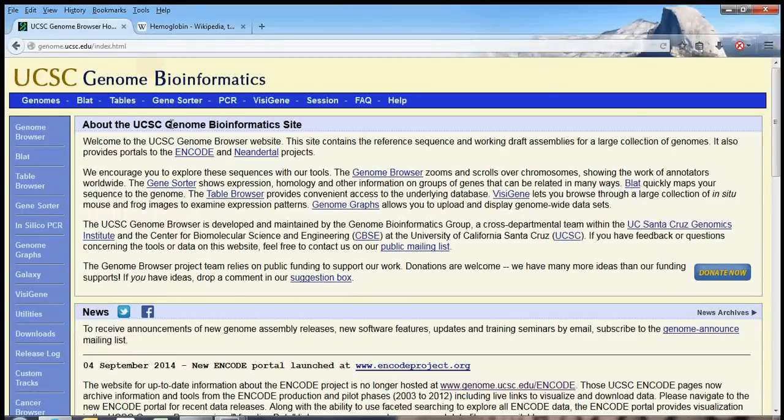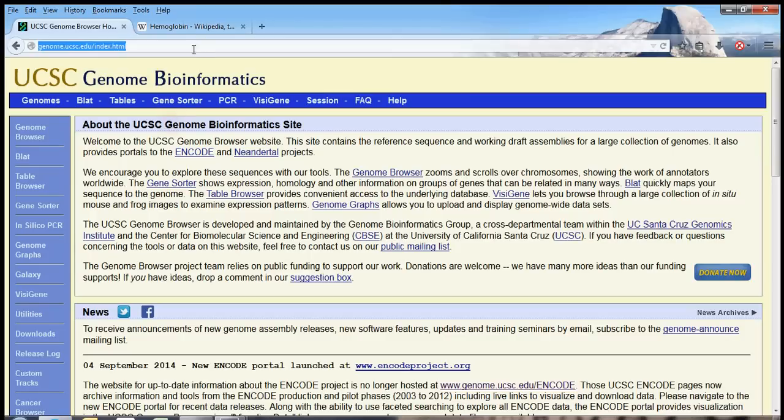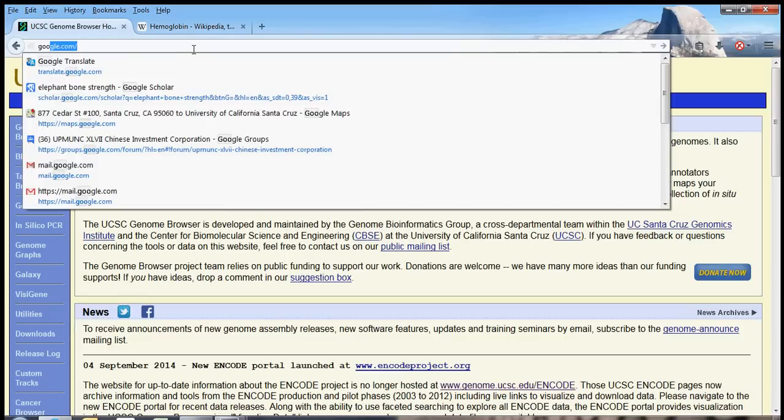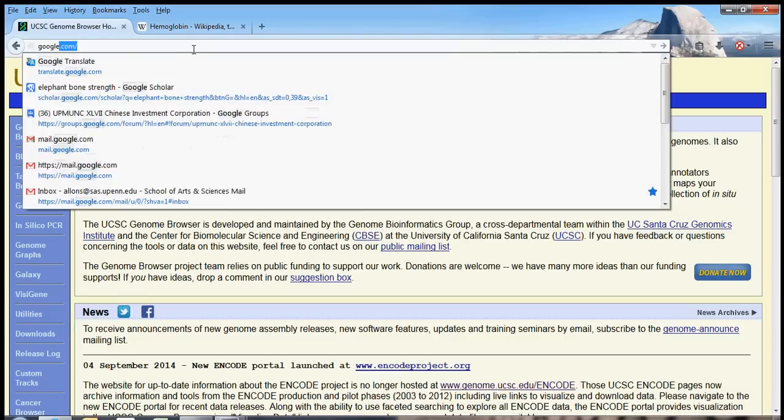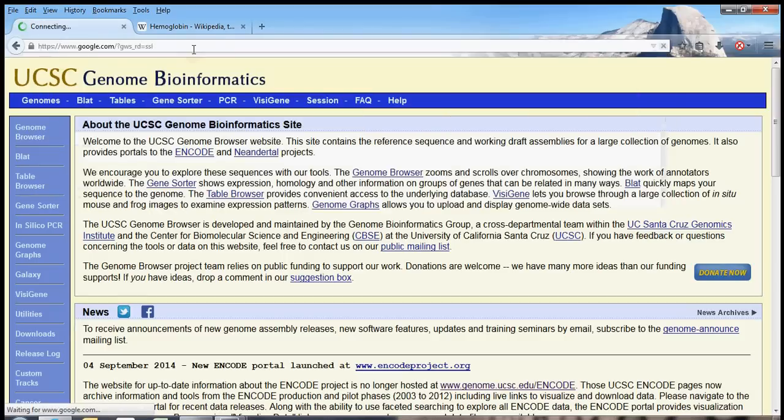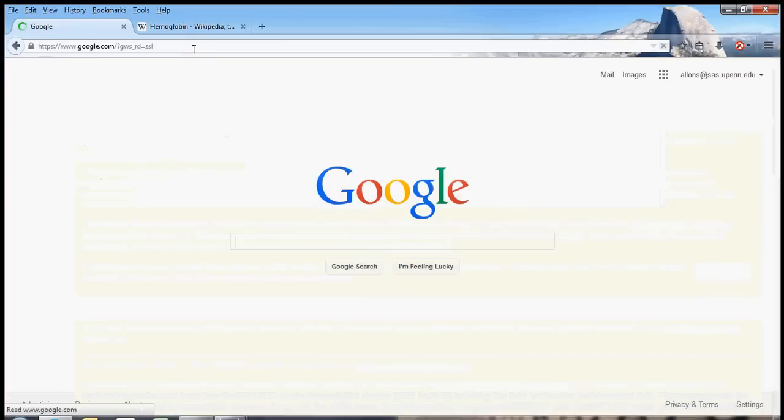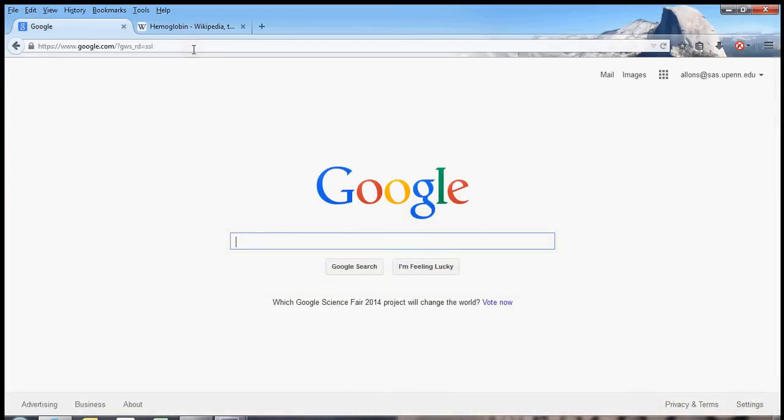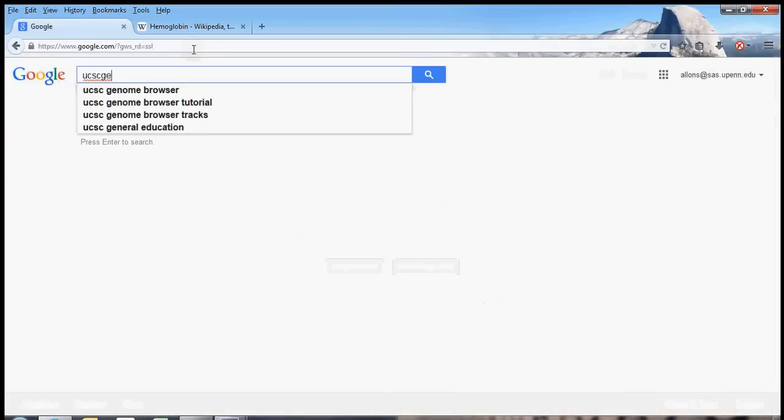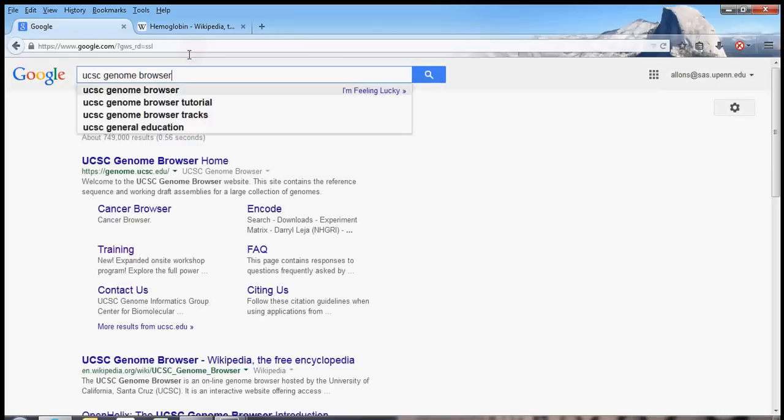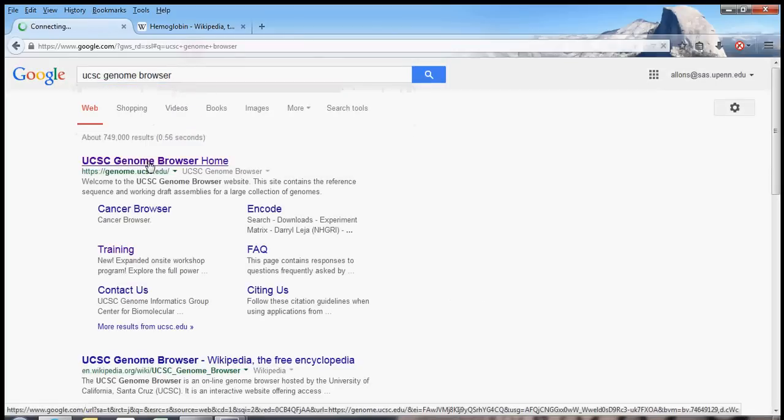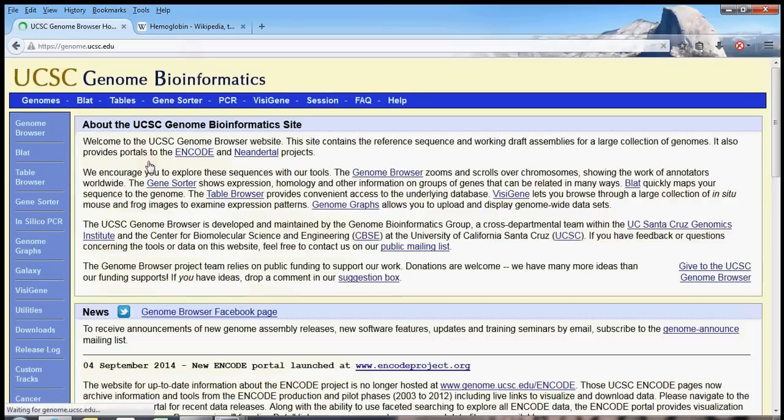This video is the first in a tutorial of how to use the UCSC Genome Browser. So first, let's figure out how to get to the Genome Browser. My favorite way is with our favorite search engine, Google. If you just type in UCSC Genome Browser on Google, you can get straight to the homepage.